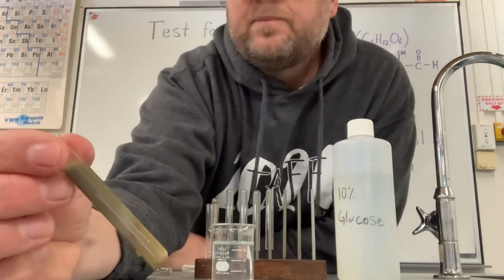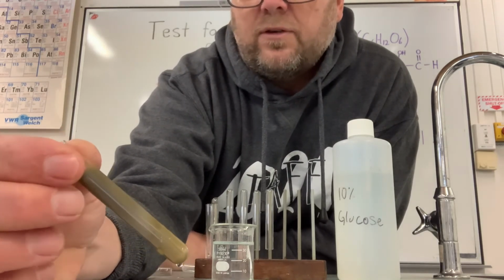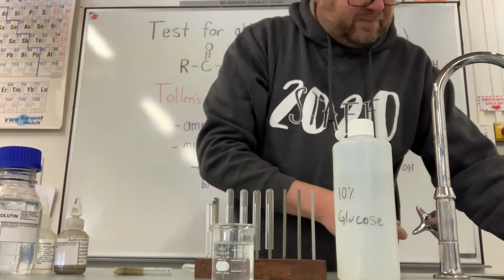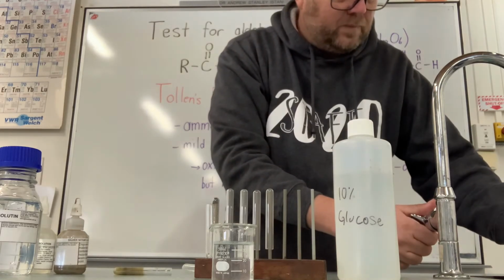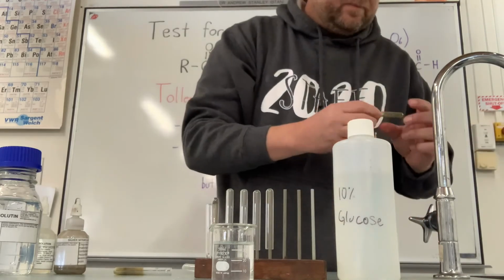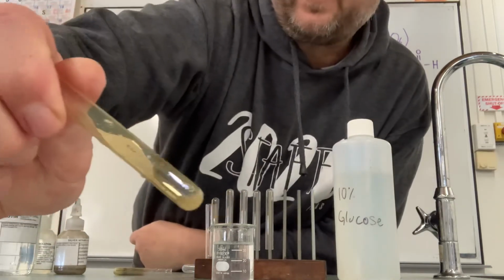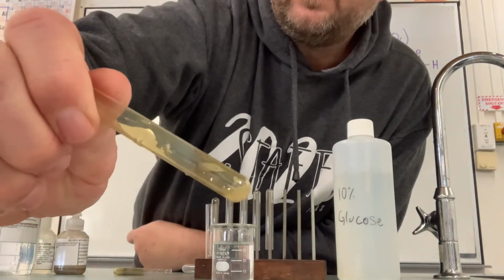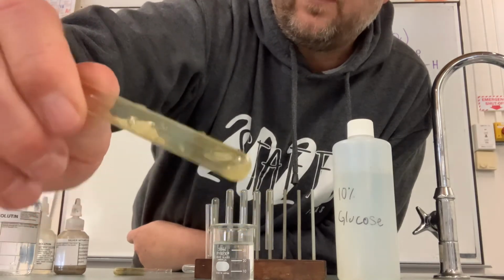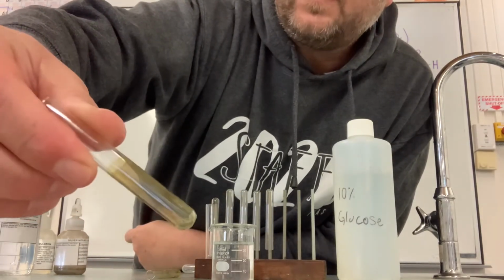This one here, we haven't got a really nice, neat silver mirror, but we can see that grey silver colour that's formed, and I'll just pour that out. Oh, you can still smell the ammonia. Now this one, that brown colour is the silver. You can see the silver's a little bit thicker in points, but it hasn't quite got thick enough to form that silver mirror.